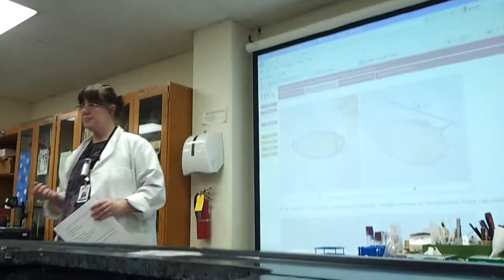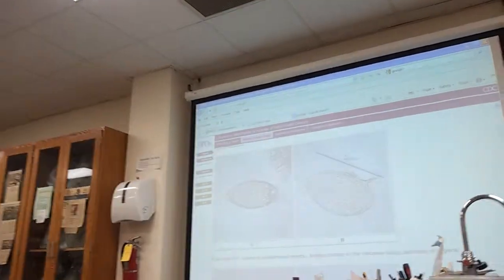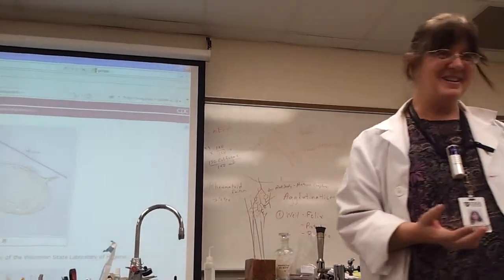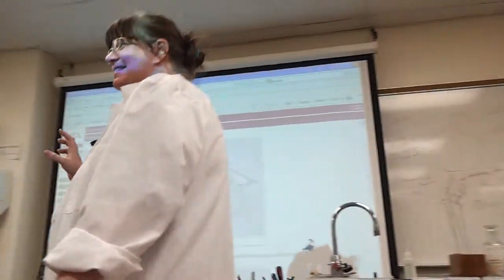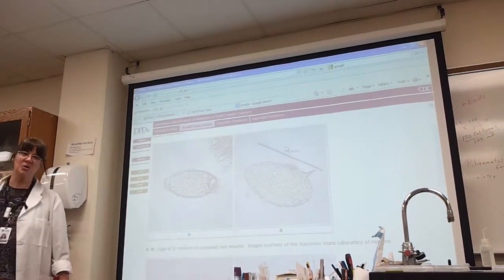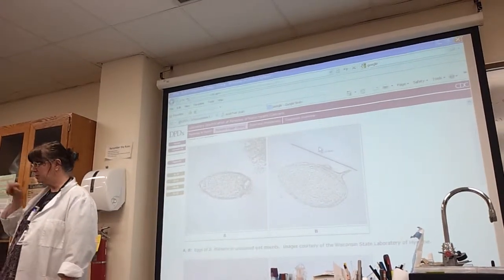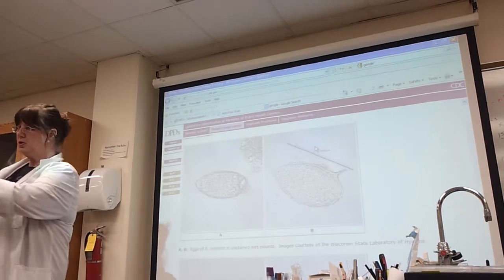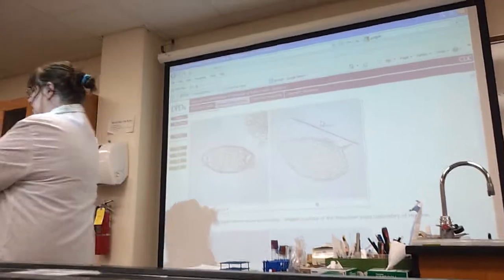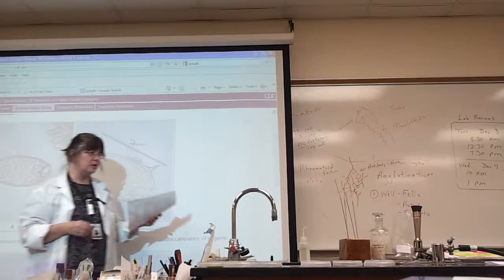Trichinella, you need to know that one. The disease is trichinosis. Trichinella goes to what muscle? Trichinella goes to your muscle tissue, which is striated. I'm trying to make y'all think, but I can't make you think because you have all the answers ahead of time. The worm curls up, and that's why it's called Trichinella spiralis, like a spiral. If it curls this way and you cut it, you can get a U inside a U inside a U. But if it's coming straight at you, what are you going to see? A little teeny circle.